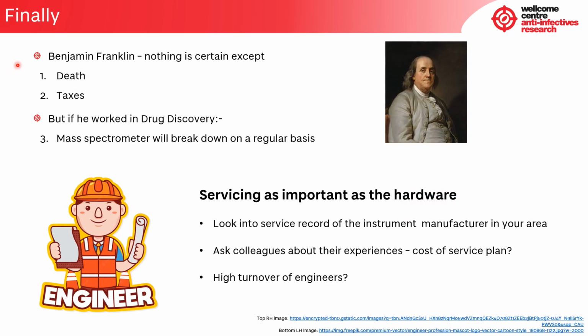And finally, I'll finish with a quote from Benjamin Franklin, who said, "Nothing is certain in life except death and taxes." But I'm sure if he worked in drug discovery, he'd probably say that the third thing that is certain is that a mass spectrometer will break down on a regular basis. And because of that, servicing is as important as the hardware that you buy. And it's worth looking at the service record of the instrument manufacturer in your area.